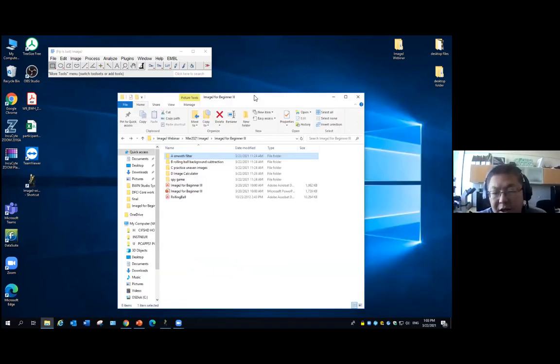For the last two parts we talked about in ImageJ, what we want is, when you have an image, we notice that the part of your interest, which is the signal, and you want to distinguish this part from the background. Okay? If you can do a nice job on this, you can achieve something we call the mask or the binary image, in which all the pixels are divided into two groups. One is the white pixels, which is the signal, our object, or what we call our region of interest. And the other pixels, which are black, are the background pixels, which we're not interested in.